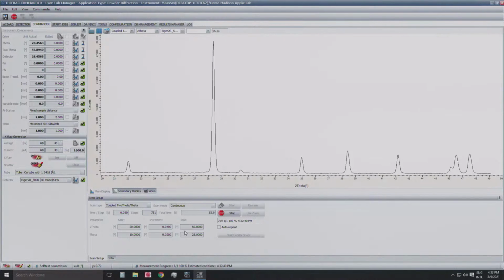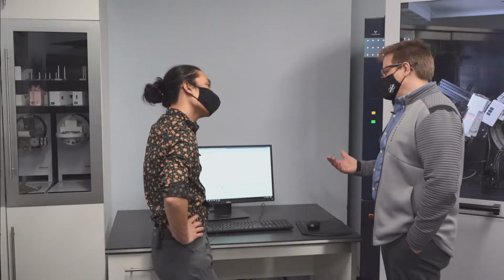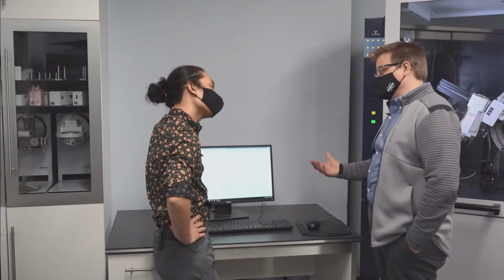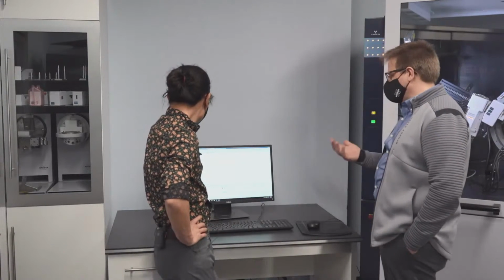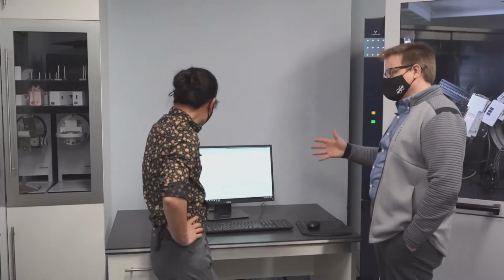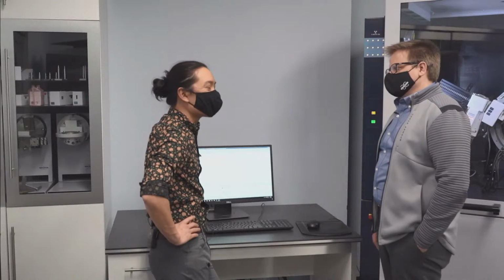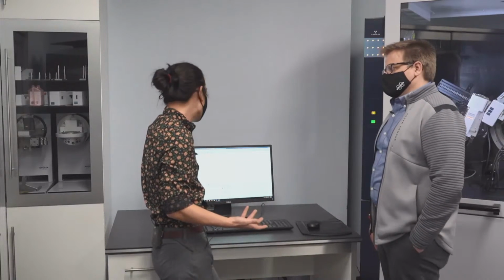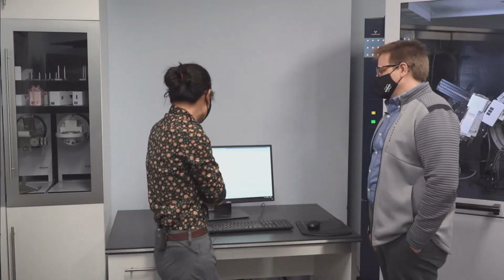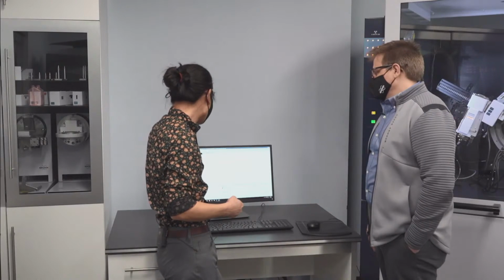And then to do some sort of quantification, we would look at peak intensities. To increase the confidence we have in that end result, though, it might be nice to know if we have any preferred orientation issues or any crystallite size issues, like that really big tall peak there. Is that actually supposed to be big? Yeah, and particularly with carbonate minerals, this particular reflection can sometimes be enhanced because the mineral has a cleavage direction. If you press down too hard on it, you can orient it. So we would be looking at something like preferred orientation or texture, depending on how you're defining that.